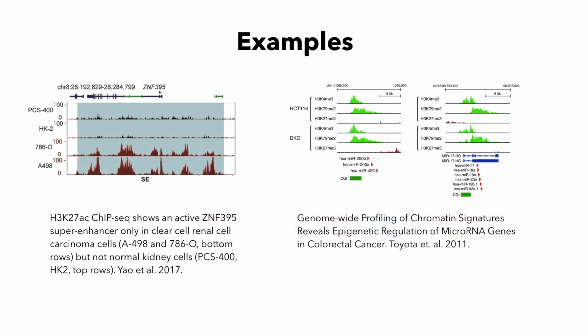Researchers are reporting that different histone modifications are associated with specific widths and profiles of peaks that can be detected in ChIP-seq data. Oftentimes, specific regions like enhancers and transcription factors or microRNAs are being studied. In cancer, neurodegenerative diseases, and other conditions, researchers are studying one or multiple types of modifications and the elements they regulate by comparing ChIP-seq profiles of groups of samples. Accurate identification of differential profiles of histone modification can lead to the understanding of epigenetic regulation specific to a condition.